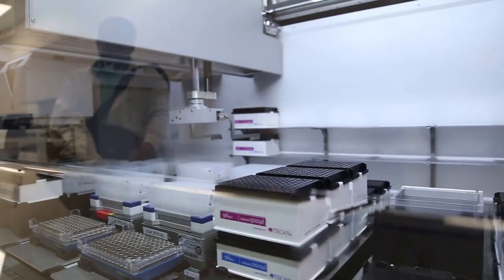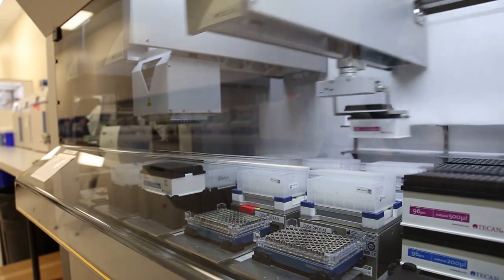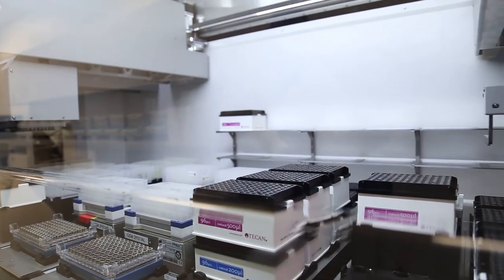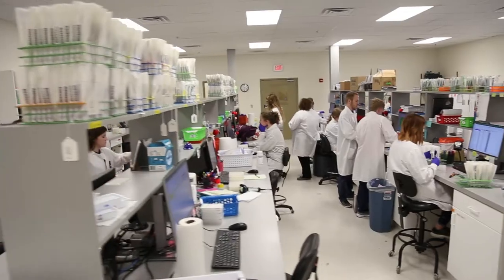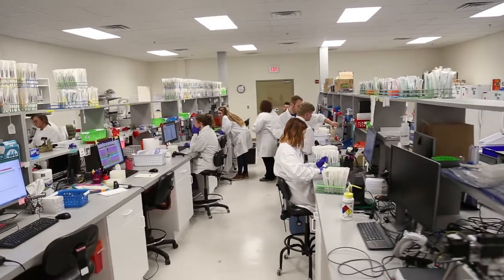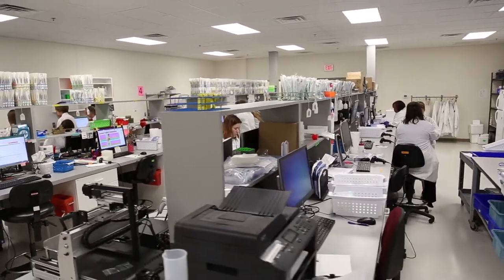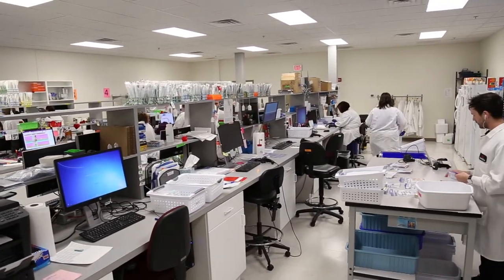Next, the lab staff place the small amount of pure DNA into special 96 well plates. These plates can hold 96 different animal samples and will be processed in economical batches. These steps, and the many ways that we use cutting-edge science to automate our technology, help Neogen ensure highly accurate DNA test data, fast processing, and affordable services.